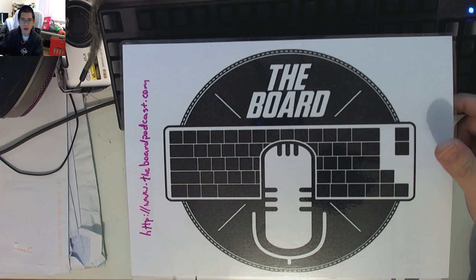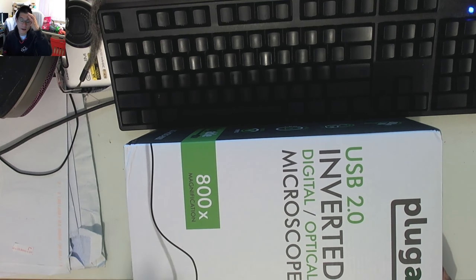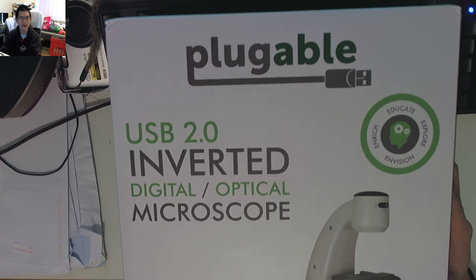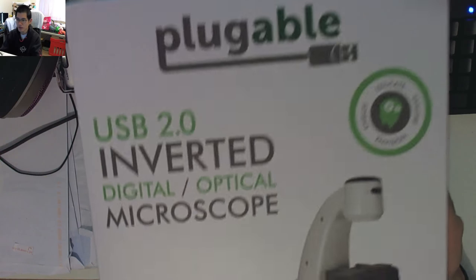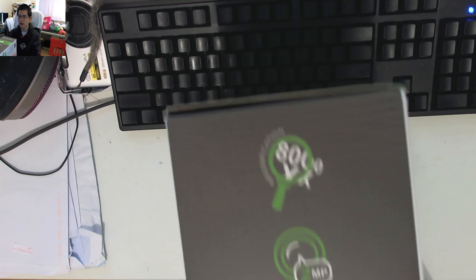So let's have a look at what we actually get. I haven't opened this up so I don't really know what I'm expecting to see inside. It's a rather large box — you can see it's pretty big. It doesn't weigh that much and you can hear little bits and pieces moving inside. On the outside it says: Pluggable USB 2.0 inverted digital optical microscope. Down here it says 800 times magnification.